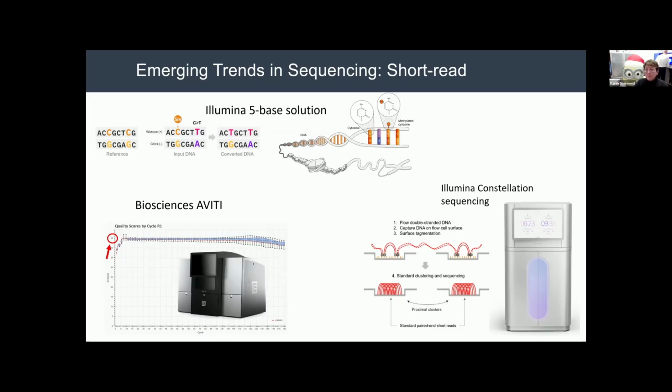Usually these are used in registries, sort of high throughput registries. And there's a new sequencer on the block, the Element Biosciences Aviti. This is a benchtop design, but has surpassed the Q40 level accuracy on 300 base pair reads. So that's outperforming even Illumina's gold standard Q levels of accuracy.